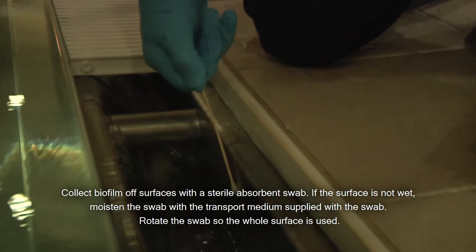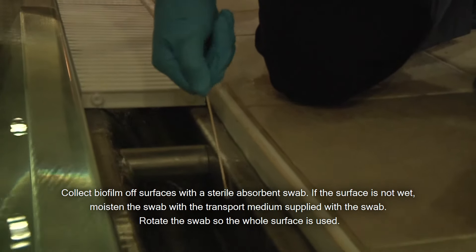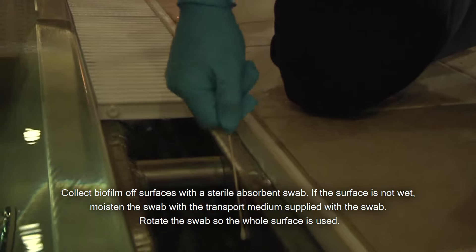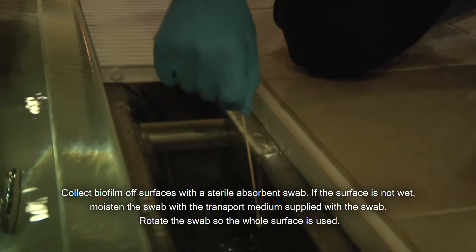Collect biofilm off the surfaces with a sterile absorbent swab. If the surface is not wet, moisten the swab with the transport medium supplied with the swab. Rotate the swab so the whole surface is used.